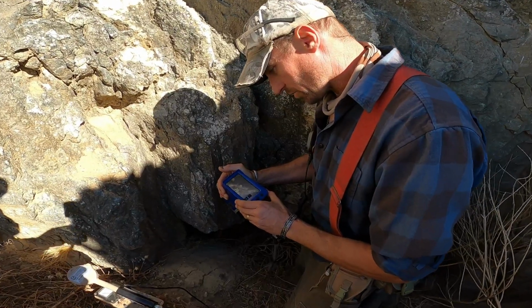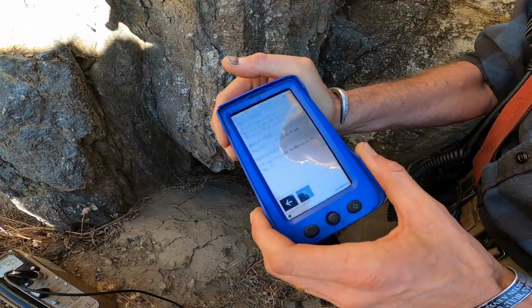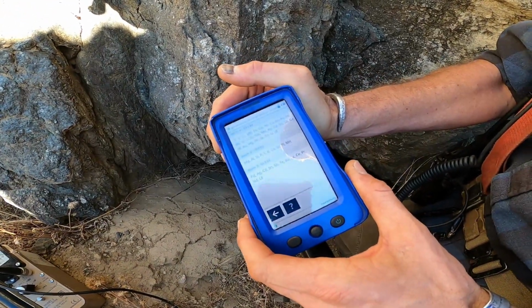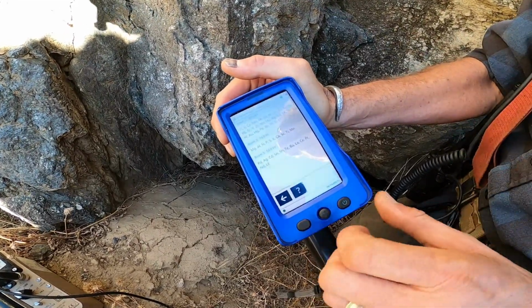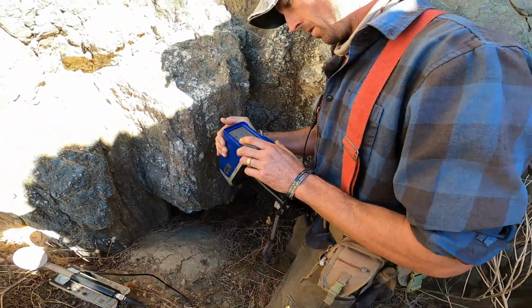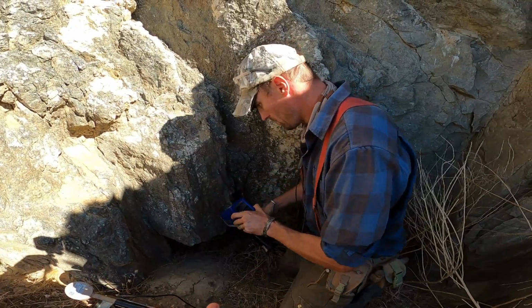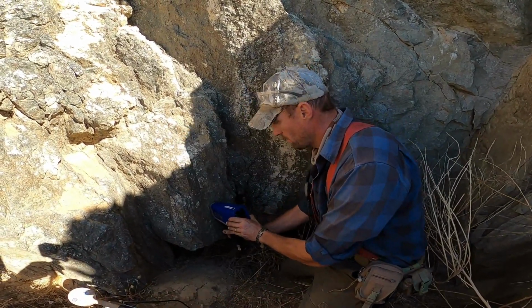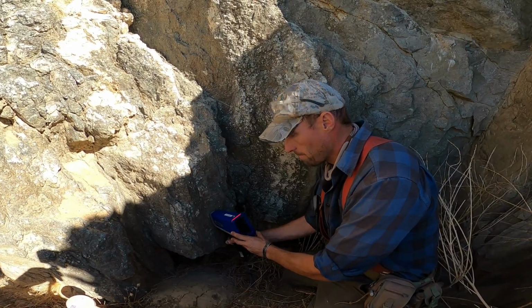I can check the elemental suite, and it tells me which beams do what elements, and that's really exciting because now I don't have to sit there and memorize things. And the Delta, you can do that, but this one, I touch it, it goes there, and then I got 3 different beams. What's awesome about those beams is if we want to spend more time testing on beam 1 or beam 2 or beam 3 based on the element suite, we can elect that in this XRF gun.